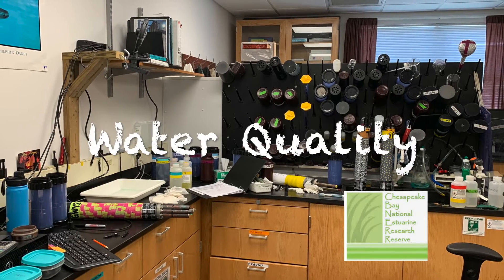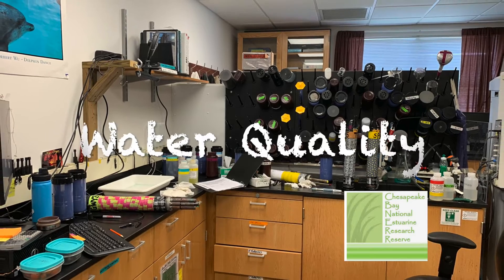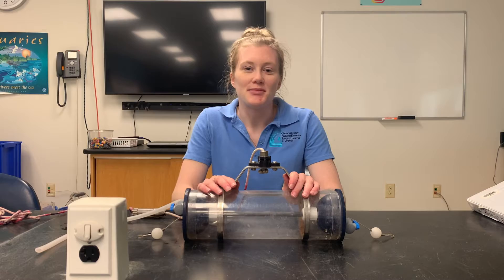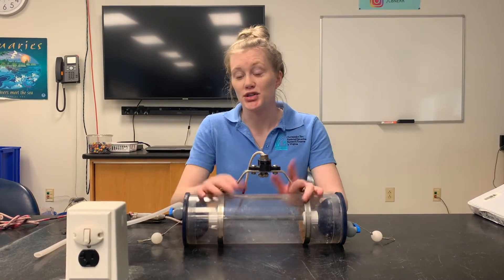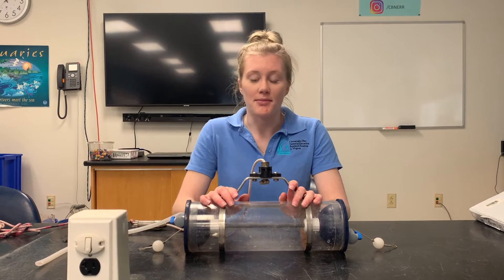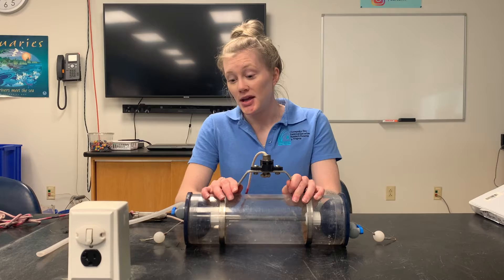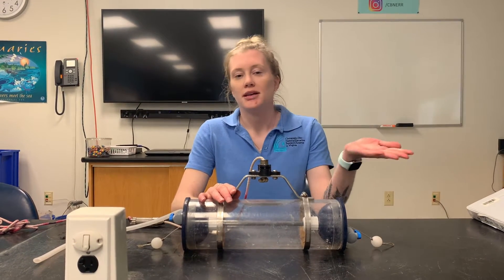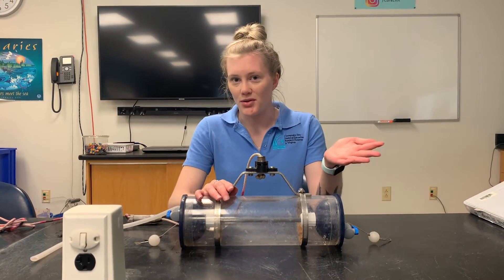For this week's Summer on the Bay, we will be learning about some of the tools used in the classroom and in the field to conduct water quality sampling. This week we are going to be talking about water quality, which is something we teach our students here in the lab on our campus at VIMS, but we also do it out in the field at our four near sites. The equipment we use can vary between the classroom and the field — we're going to talk about a few of those pieces today.